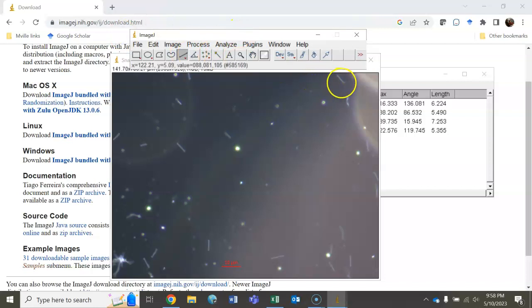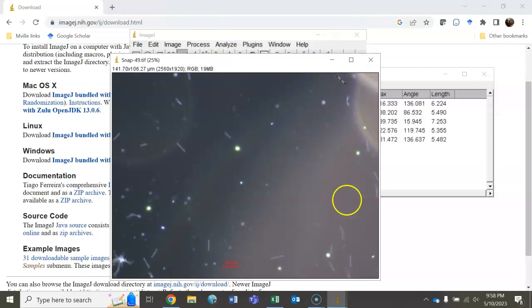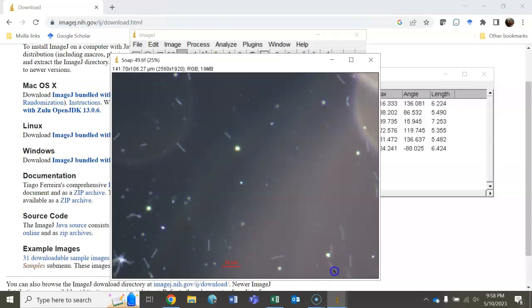I would avoid this one because it looks like it could be out of focus. This one at the top right here, I would definitely capture this one. This one's pretty easy to measure. Make sure it's an accurate measurement. Grab this like that, and control M. Down here, the same thing. This one looks pretty good. I can grab this one. I could grab this one. Et cetera.